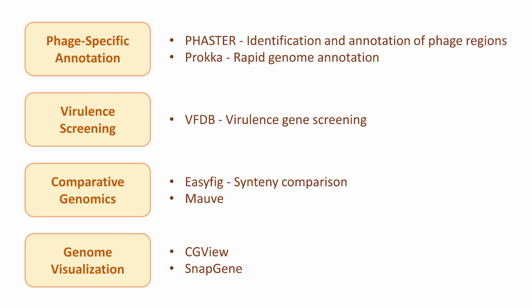In summary, this workflow demonstrates how Nanopore sequencing data can be transformed into a fully annotated bacteriophage genome and the tools available to perform genome analysis.